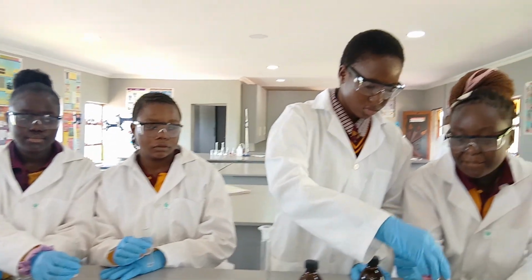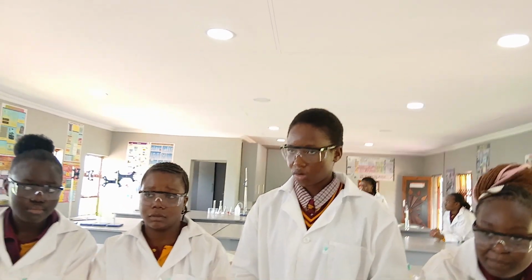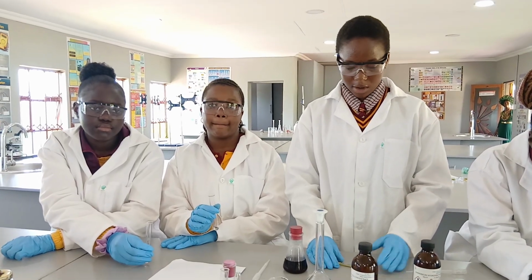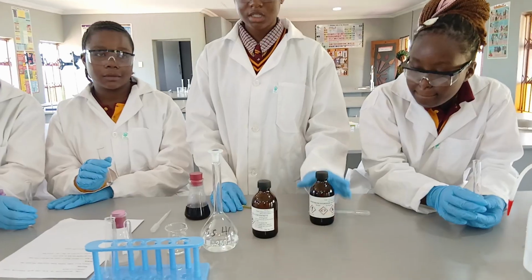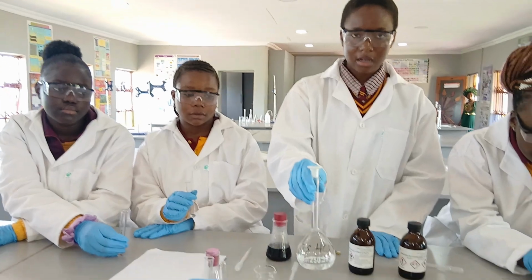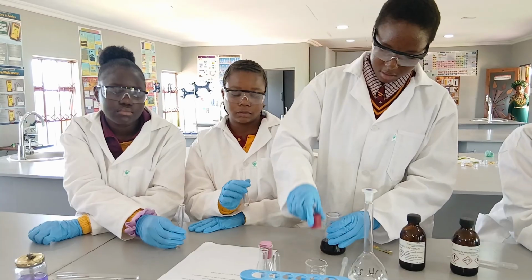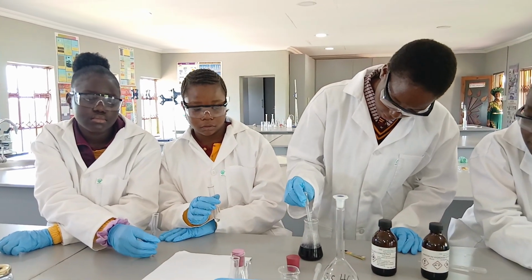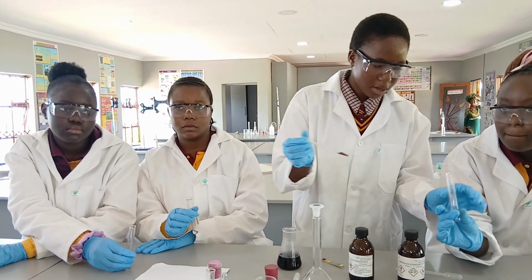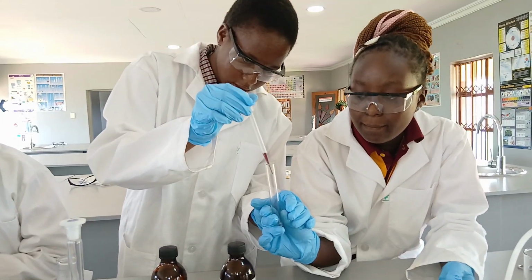Then we're going to use our hibiscus flower indicator to test our 3 solutions. We have our ammonium hydroxide, which is a base, acetic acid, which is an acid, and HCl, which is also an acid. So I'm going to use a dropper to extract some of the indicator, and then we are going to pour it into our first test tube and see if it's really a base or an acid.